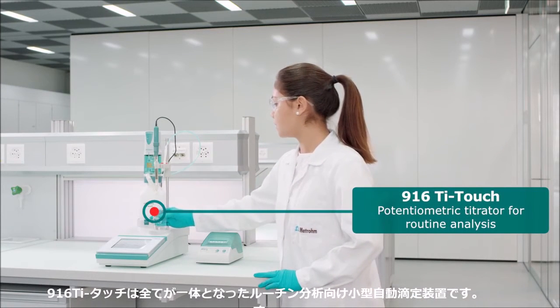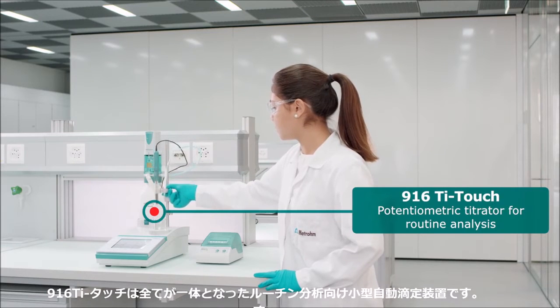The 916 Ti-Touch is your compact, all-in-one solution for routine analysis.